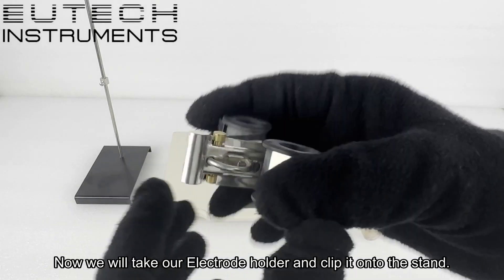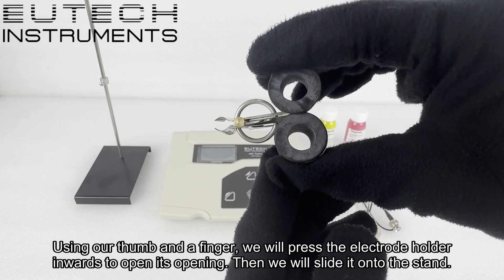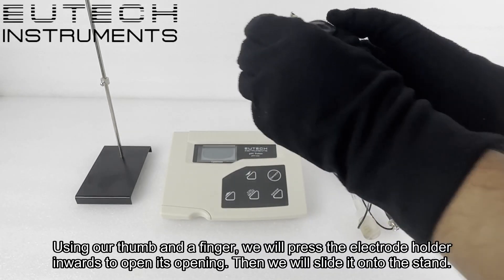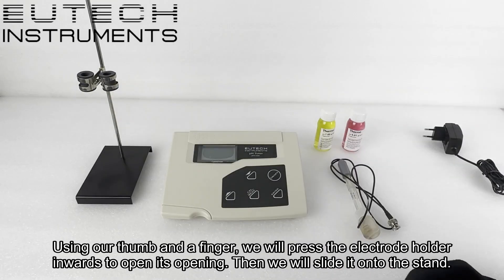Now we will take our electrode holder and clip it onto the stand. Using our thumb and a finger, we will press the electrode holder inwards to open its opening, then we will slide it onto the stand.